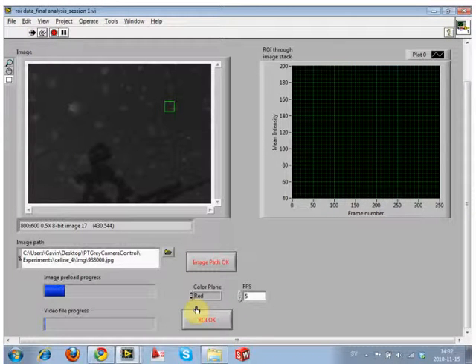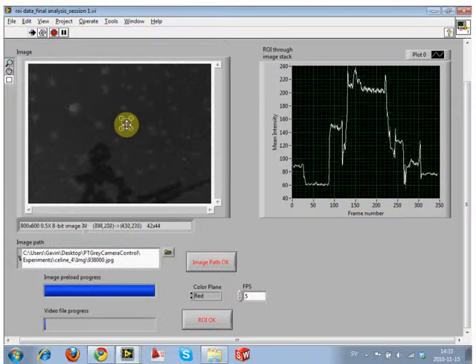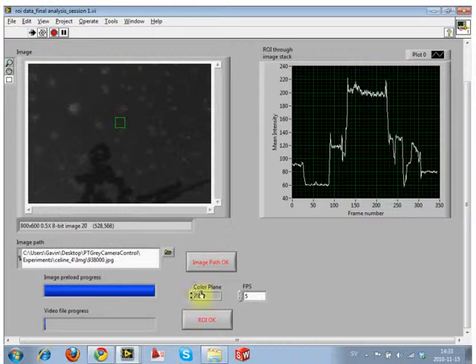The reason why it was stopped is because we didn't hit this button before. You have to hit that button to make it keep going. So we wired them as user inputs, just to show that it keeps live. And then it writes a little video. There should be no errors, and it should just stop. There we go. And then we should have this folder, and it's got all three things in it.